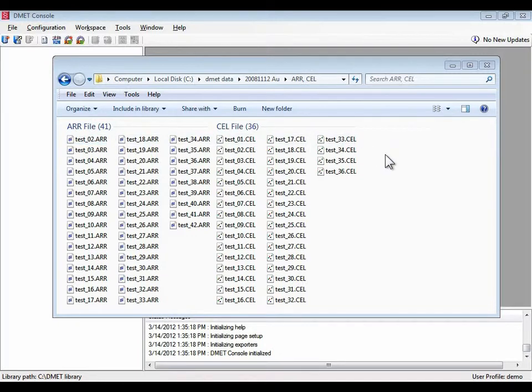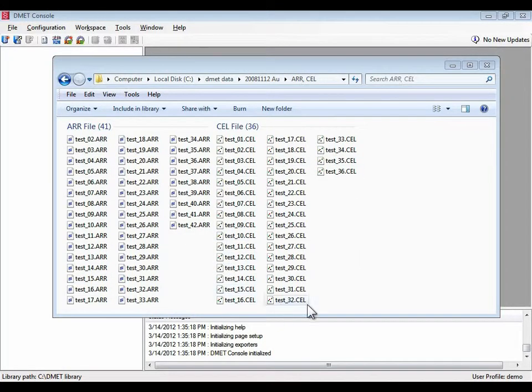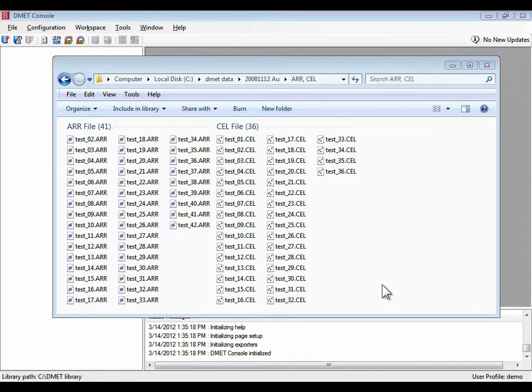So here we have a folder with data that I want to work with. You'll notice that the set of ARR files is larger than the set of cell files, and I've done this to highlight some problems that we're going to run into later.